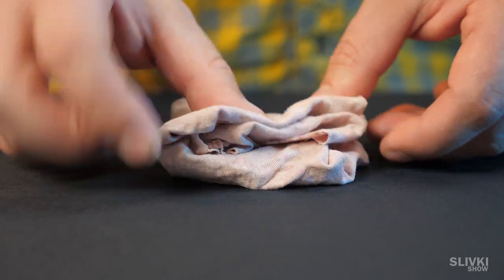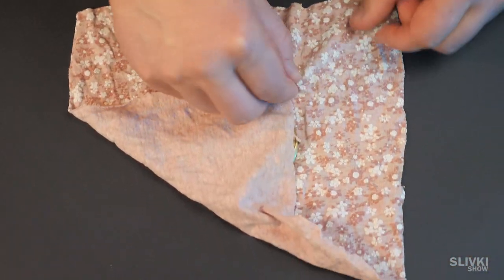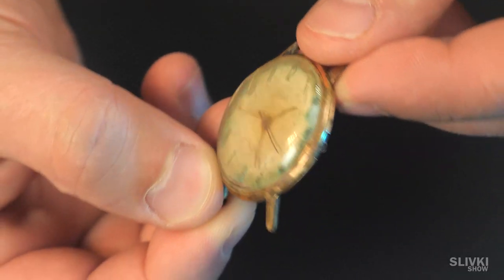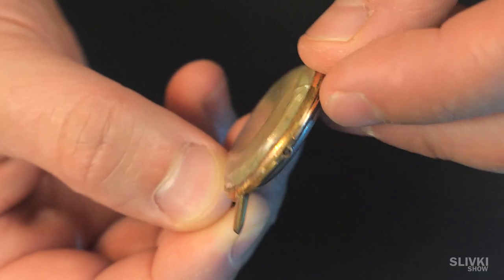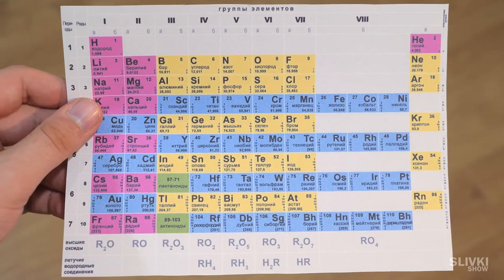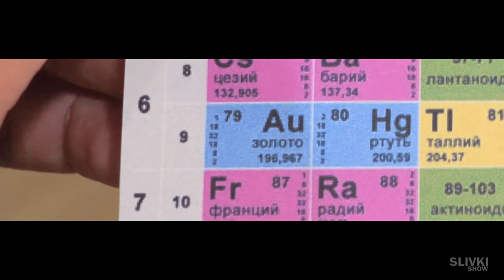Grandma left old watches as a legacy that aren't functioning now and can't be repaired. We almost wanted to throw them away, but while looking closely, we saw an AU stamp on the housing. Getting Mendeleev's table, we understood these watches are gold-plated.